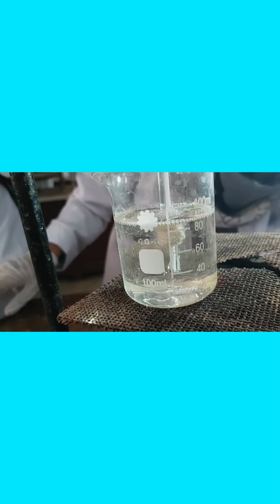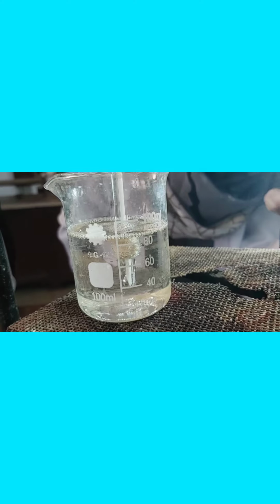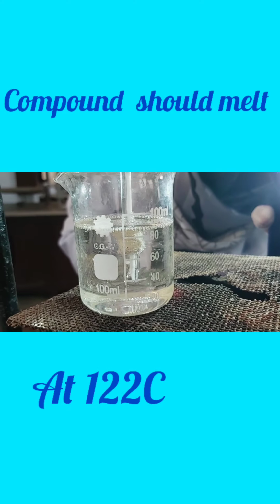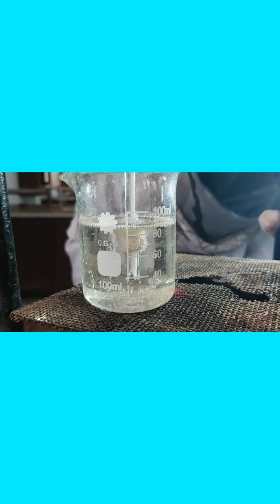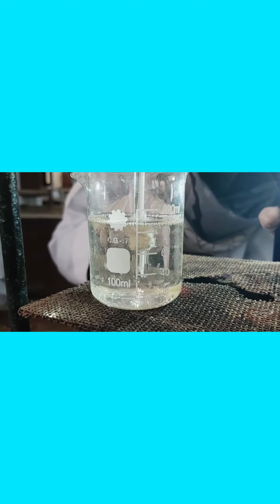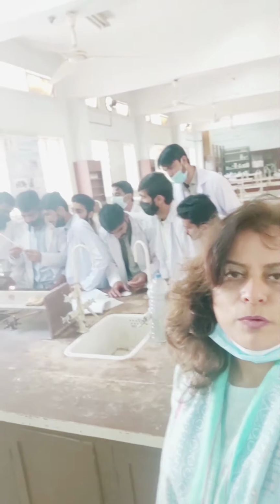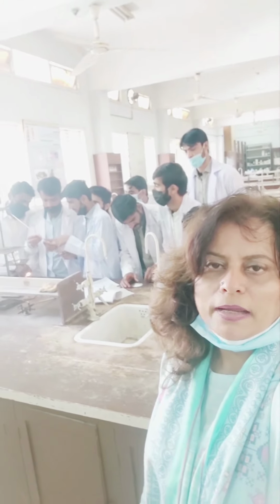We are recording the melting point. Students are recording the melting point, just about to. It has reached 120. Now it's right. It is melting, I can see it. Yes, ma'am. Now, ma'am, melting is complete. Complete. Stop. Check the temperature.